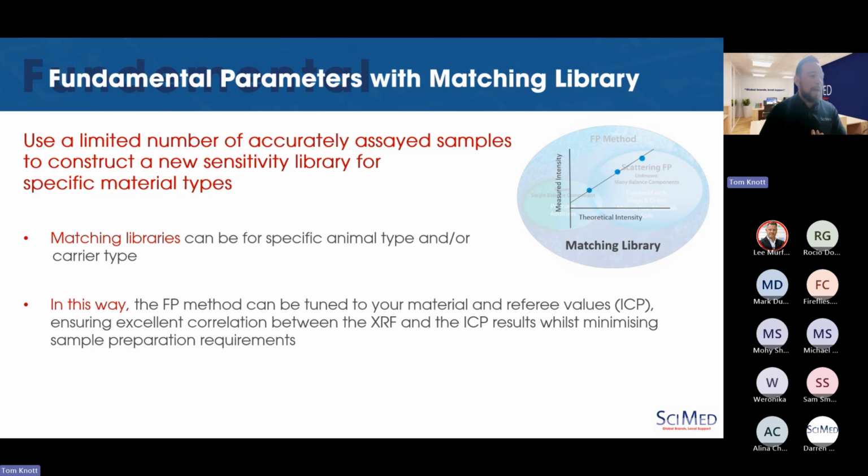And where this becomes really powerful is when this is correlated with ICP results, you're getting very, very close agreement to those sorts of analyses, while simultaneously mitigating the need for all the digestion approaches, which is how you're eliminating those particular sample solid matrix effects in those techniques.